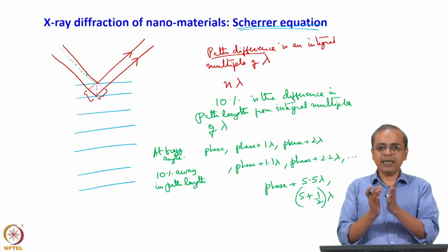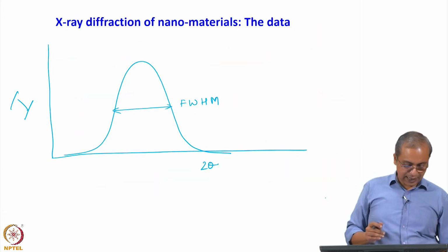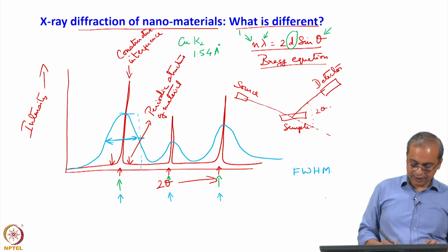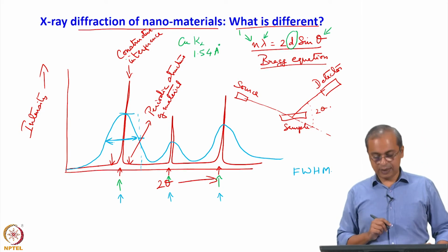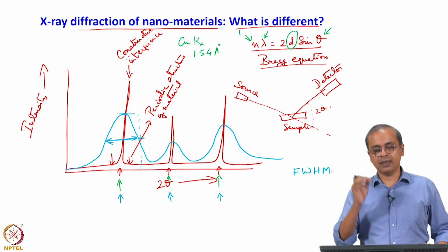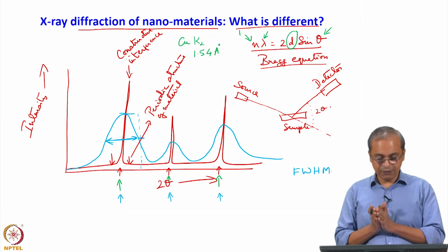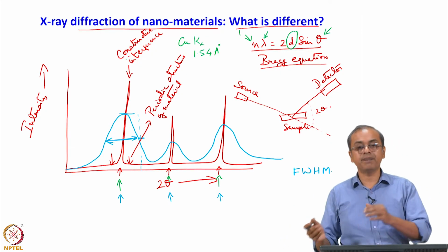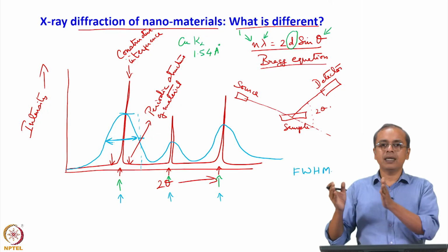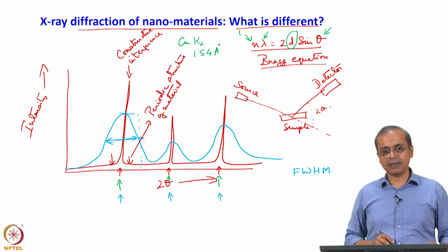So that is the idea of the X-ray diffraction pattern, and that is the reason that I say that the perfect constructive interference, with the path lengths being an integral multiple of lambda, the same phenomenon actually creates the destructive interference when you are even marginally away from the Bragg angle.